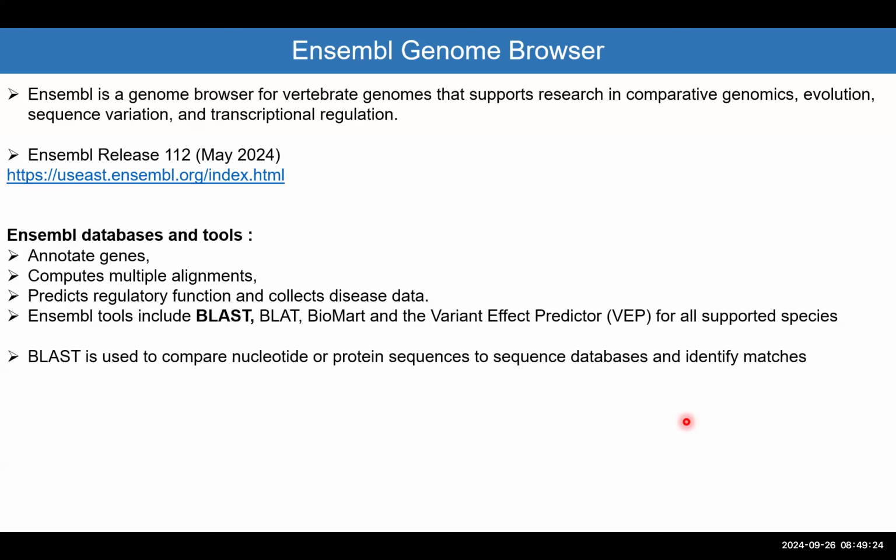Maybe Ensembl is one step ahead by creating a more friendly profile on the web. So you can click and find directly the exons, click and find directly the introns. With one click, you can get the SNPs. But again, those two browsers can get you almost the same information.